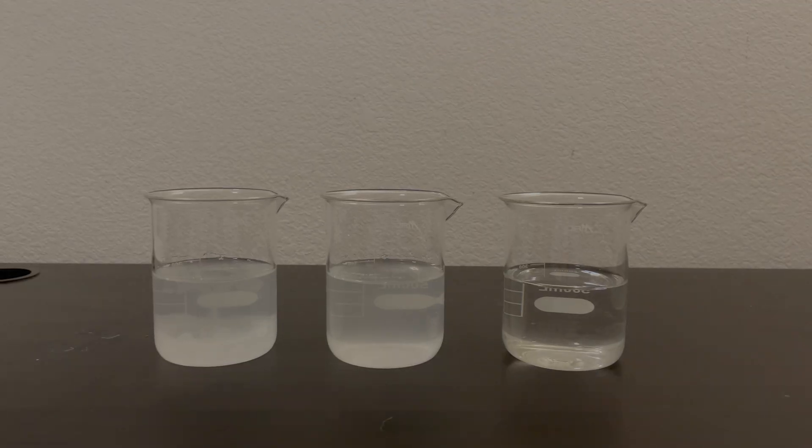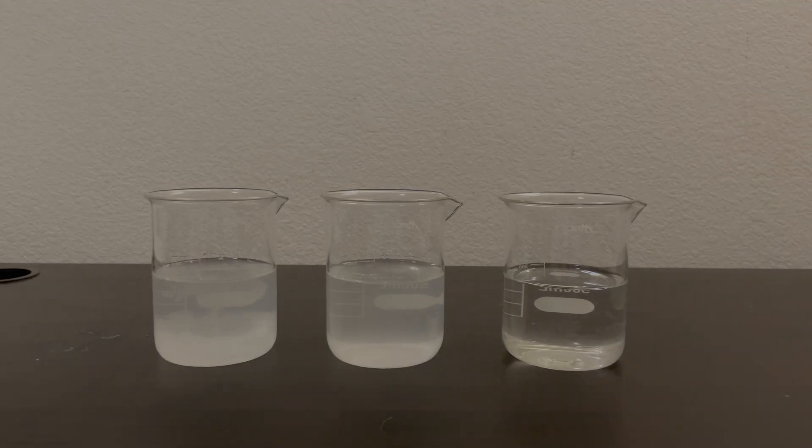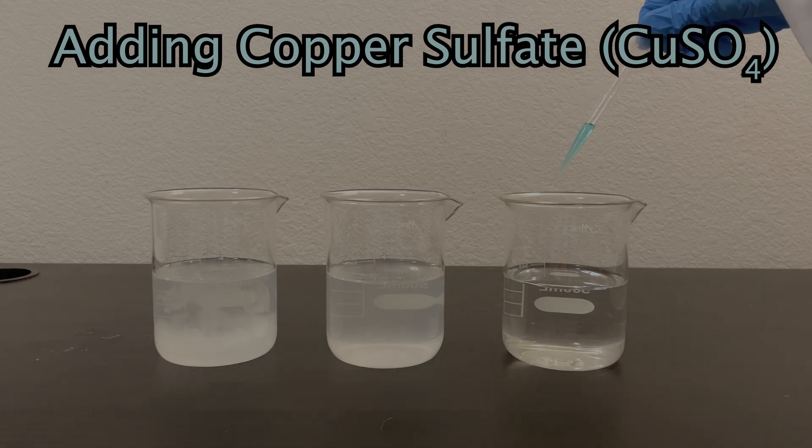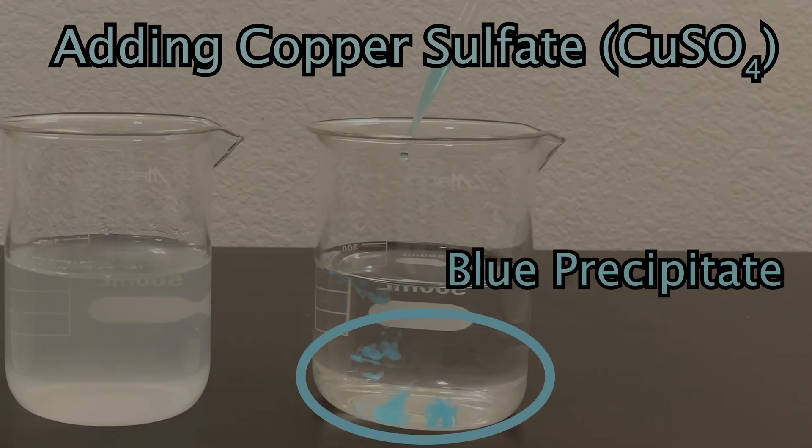In the beaker on the right, I'm going to add a few drops of copper sulfate. And you can see a nice blue precipitate forms.